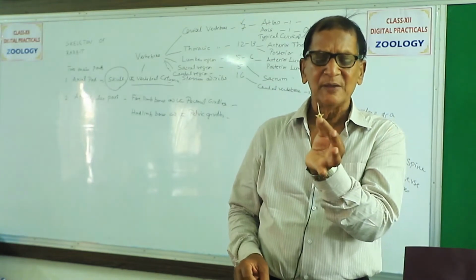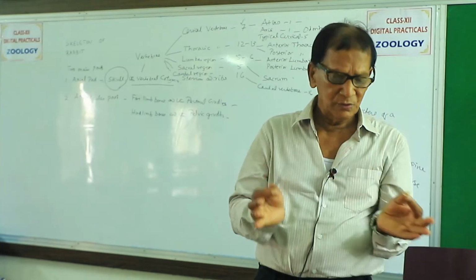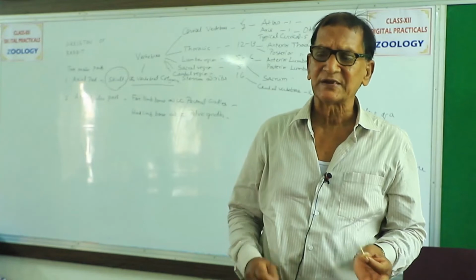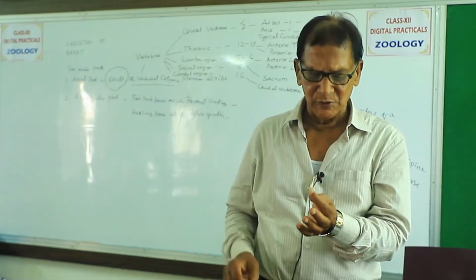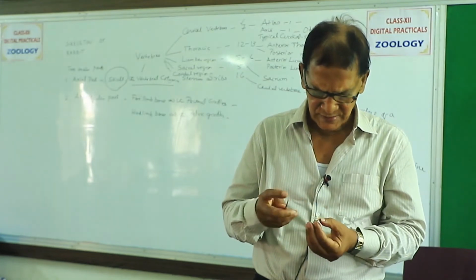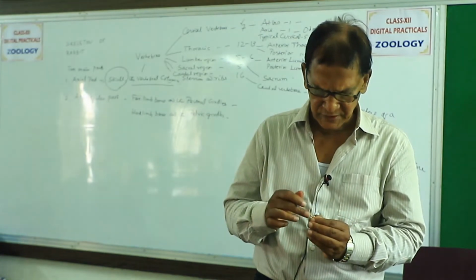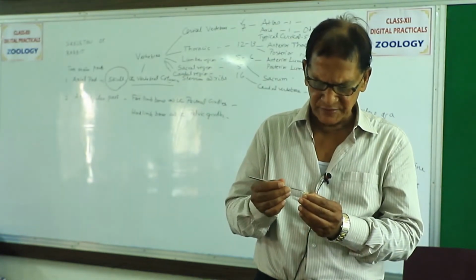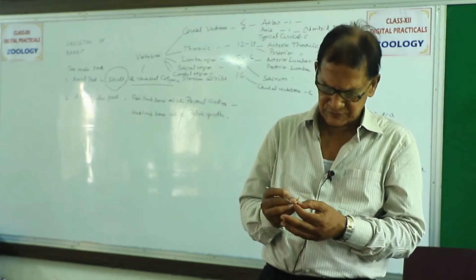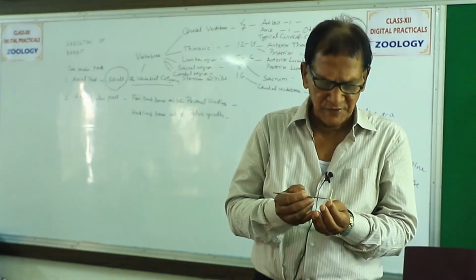So we have this amphiplatyan centrum, then there is this neural canal. No more is the vertebrarterial canal present, because the vertebrarterial canal was present in the cervical vertebrae only. Then we have these pre and post zygapophyses. You see, these are pre-zygapophyses because they are turned upwards, and these are post-zygapophyses because they face downwards.